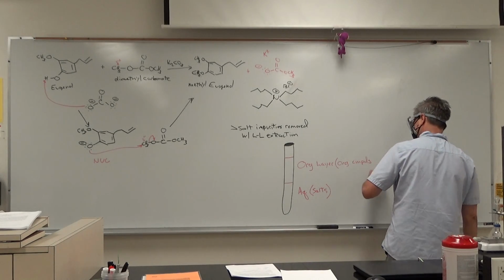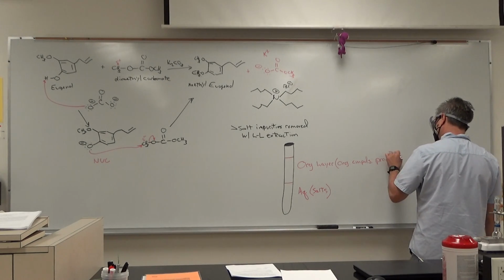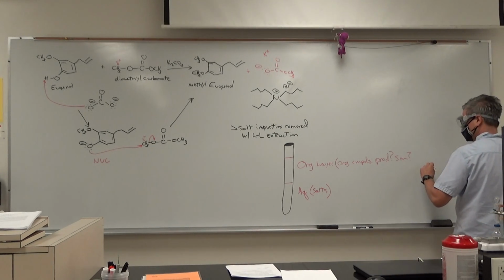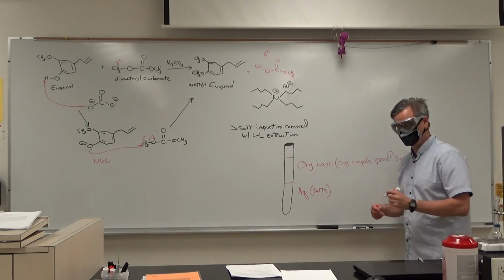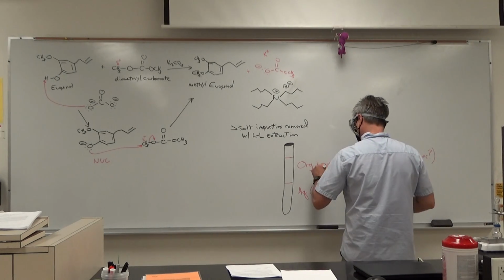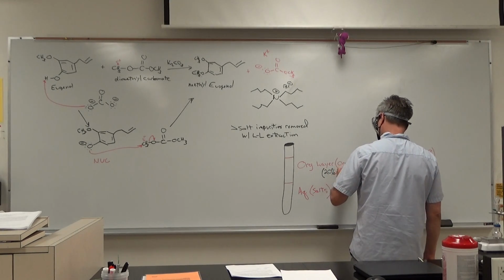And that could be product, remains to be seen. Starting material, remains to be seen. Unreactive starting material, remains to be seen. Other, don't know. But all your organic stuff will go up in there. And that is our, by the way, 20% ethyl acetate in hexane.